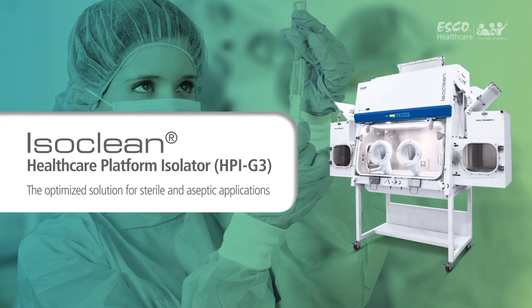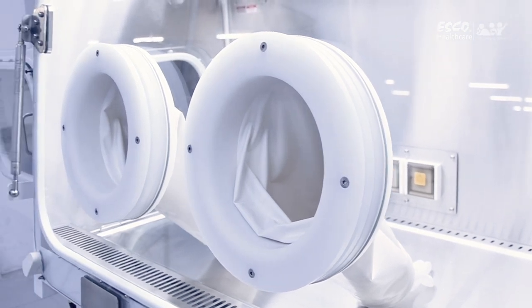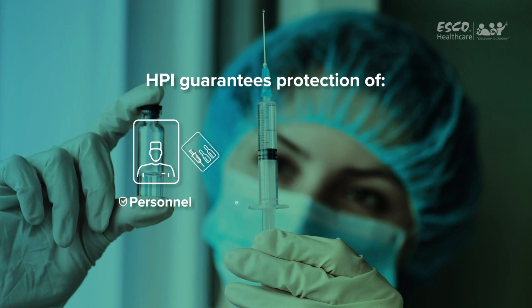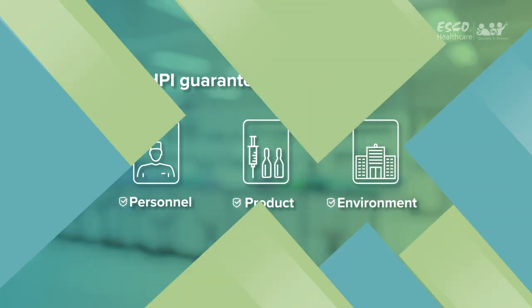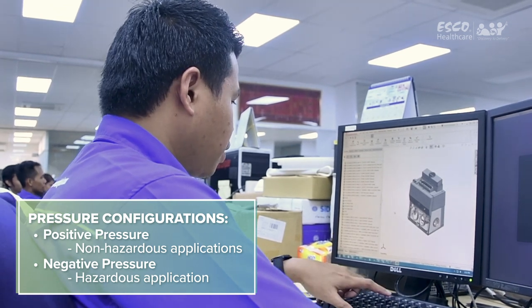IsoClean Healthcare Platform Isolator — the optimized solution for sterile and aseptic applications. The IsoClean Healthcare Platform Isolator facilitates the isolation of a product or process while providing the required sterile or aseptic environment. This equipment provides a comprehensive range of personnel, product, and environmental protection. It is factory-configured to operate at positive or negative pressure, depending on the application it is intended for.